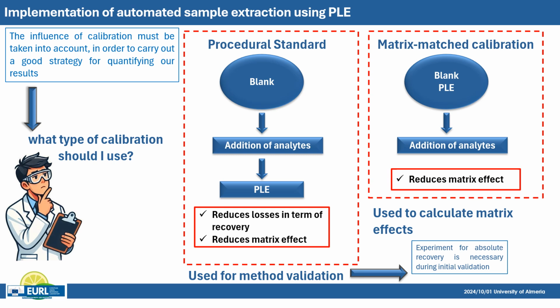The strategy for quantifying our results: procedural standards used for method validation, and matrix-matched calibration used to calculate matrix effects.